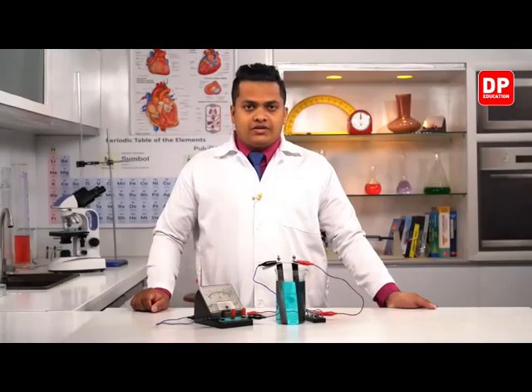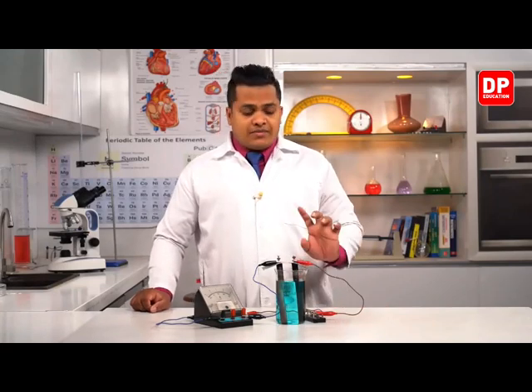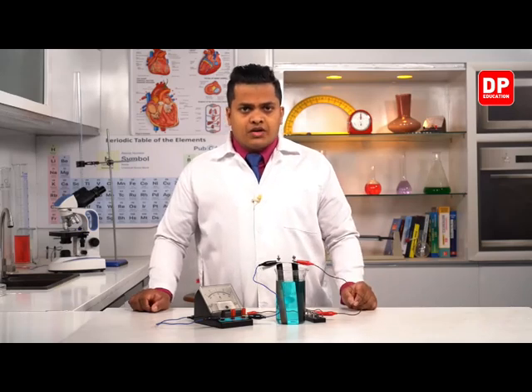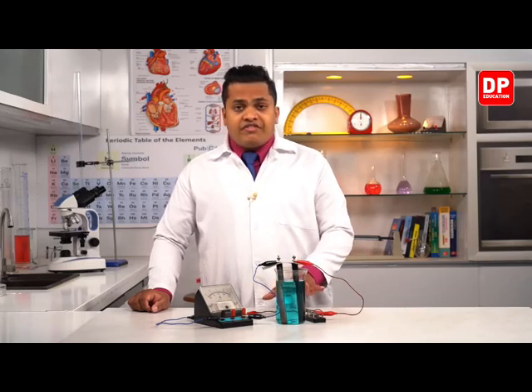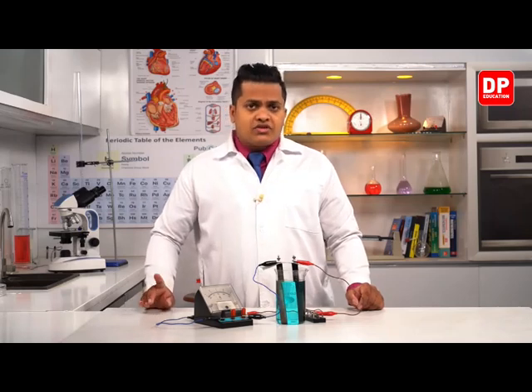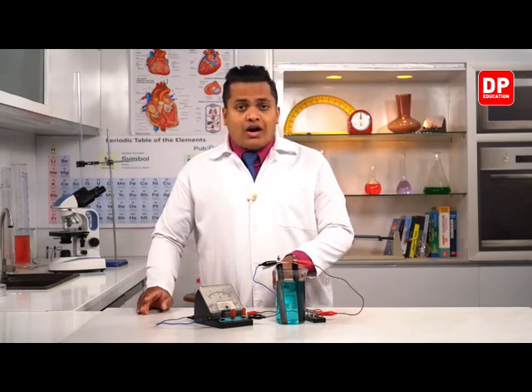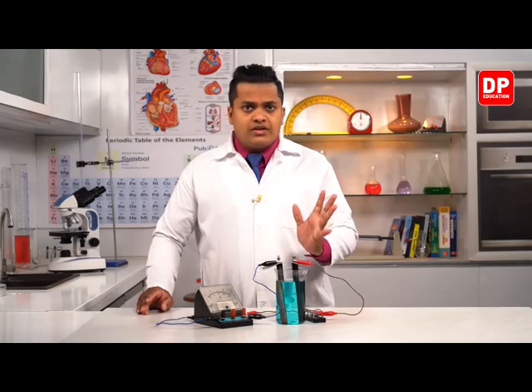So my dear children, as you can see here, the rate of air bubbles coming from the positive terminal has dramatically reduced. And you can also see that there is a clear change in the solution as well, a very clear change. Earlier, when I was starting this practical, you were unable to observe what had happened with the negative terminal. There was no clear observation.